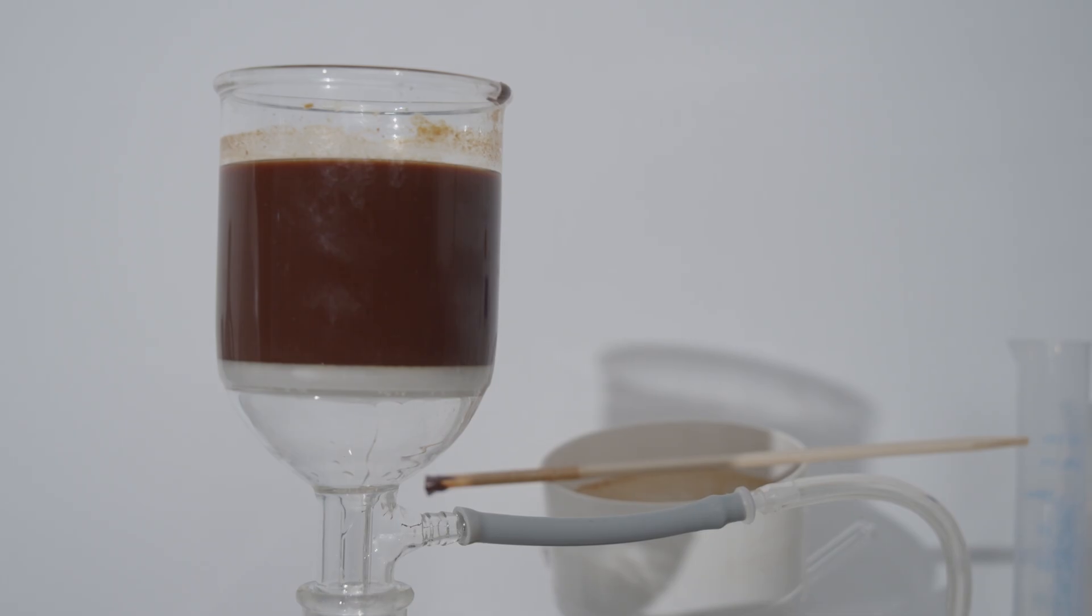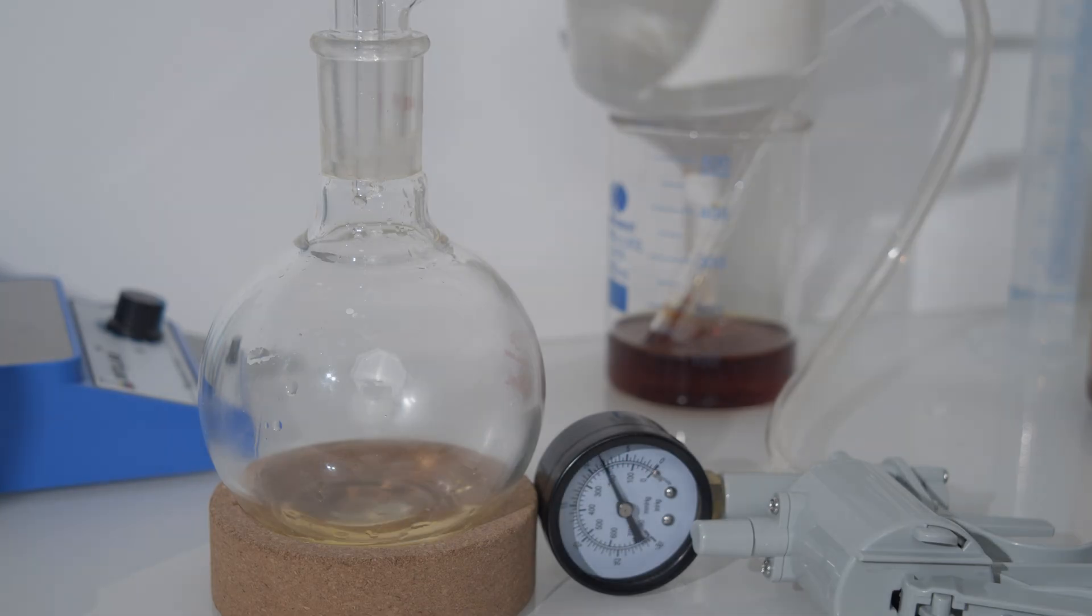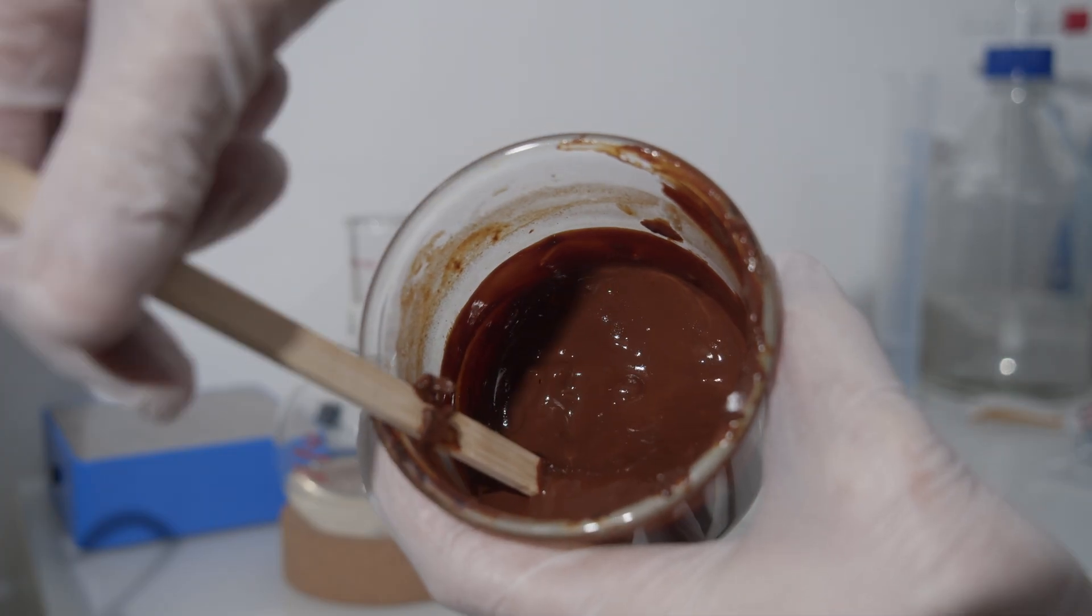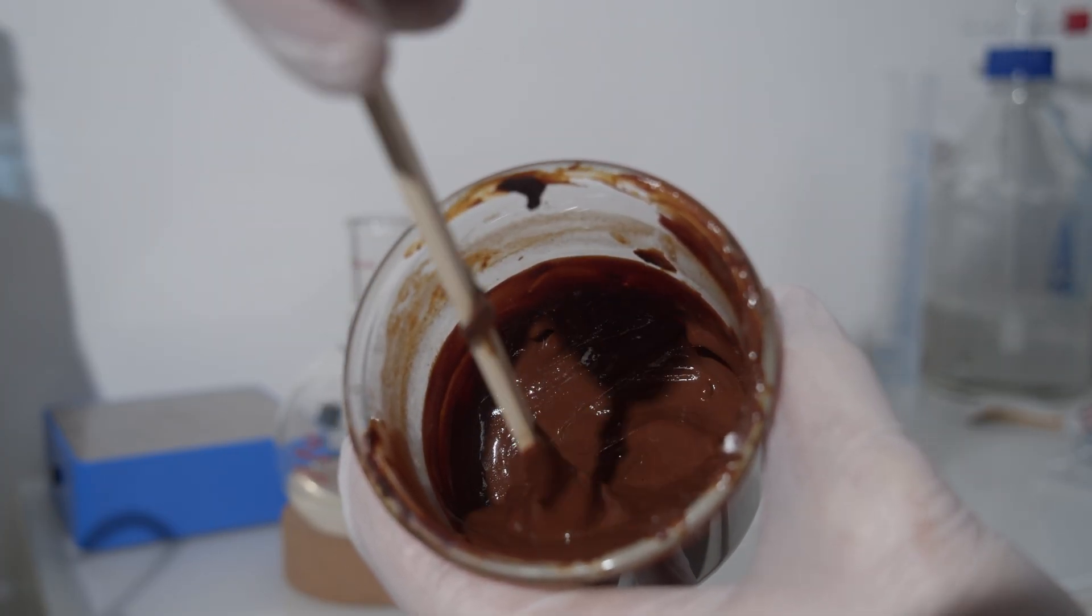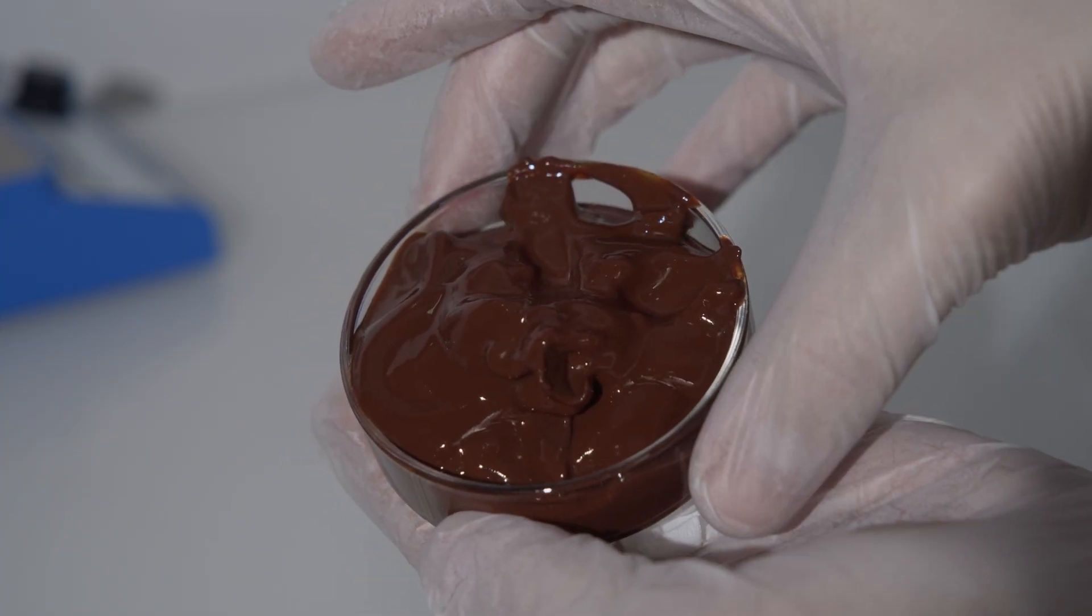The filtration was a disaster. The iron 3 hydroxide was too thick, it completely clogged the filter. Even with vacuum filtration, it took over 3 hours to finish. After filtration, I carefully scooped the thick iron 3 hydroxide sludge and transferred it onto a petri dish for the next step.